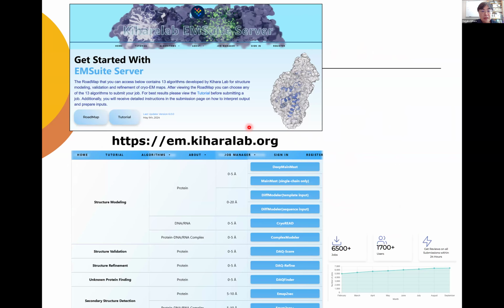This is my last slide from my side. All of the tools are available on this web server. You can just click the methods you want to use, upload your map and sequence, and the server will do the modeling automatically.